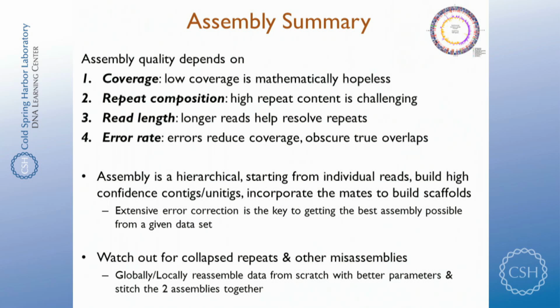We're going to start from individual reads, look at overlaps, build up initial contigs, overlay it with mate pairs, overlay it with genetic maps, other long-range information to try to put together entire chromosomes. You just have to be really careful to watch out for all these complicated things. If you're trying to publish this, please call me up, right? I'll talk to you about strategies that we can use to help you detect that we're not making too many mistakes along the way.